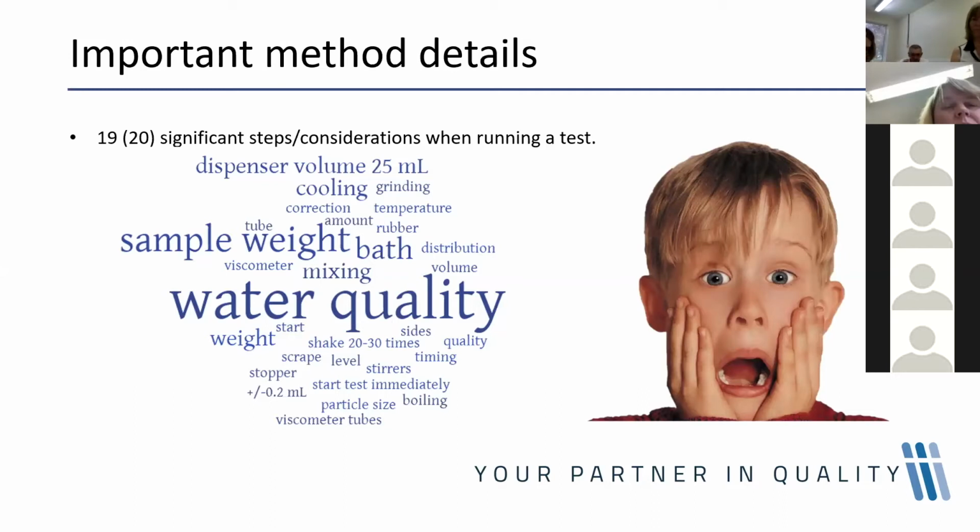So when running the test, there are about 20 significant steps that you would consider that have a significant effect on the test. Now, one might think that if I have to think about 20 different things to get this test running right, it surely must take a lot of time.